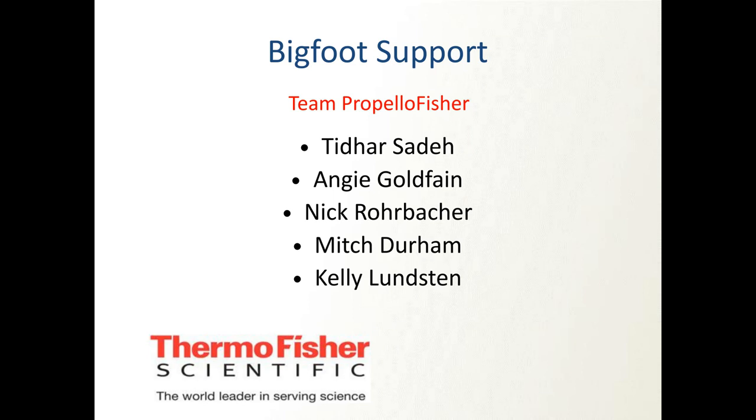Yes, I believe, I can't say yet, but I believe there are subtle differences that have to be looked at, but I don't think one or the other makes or breaks an experiment. I think they can be used together, and as long as you're defining your autofluorescence with whatever cell type you're using, you're probably going to be okay. But once again, this is some of the bleeding edge stuff that we're trying to figure out now. I know Cytek's looking at that as well, and in some communications, Maria says that in certain areas of the spectrum, beads and cells can behave a little differently.